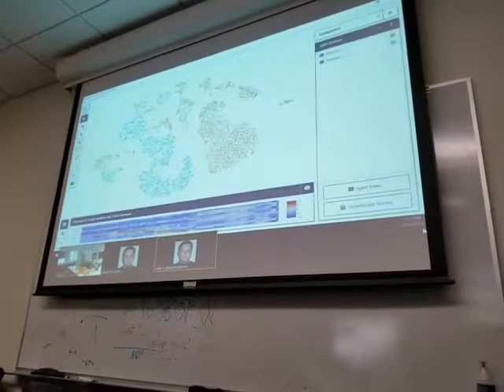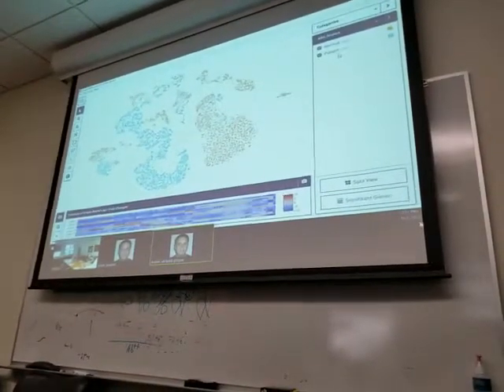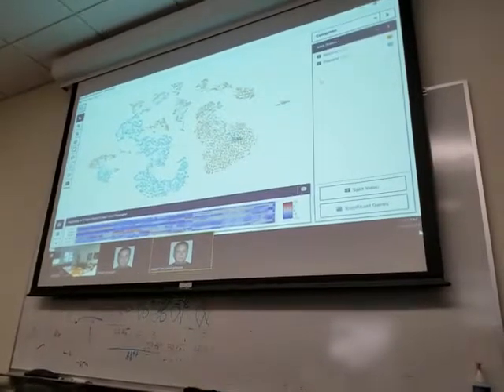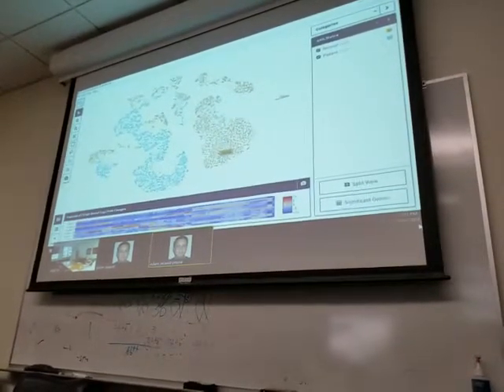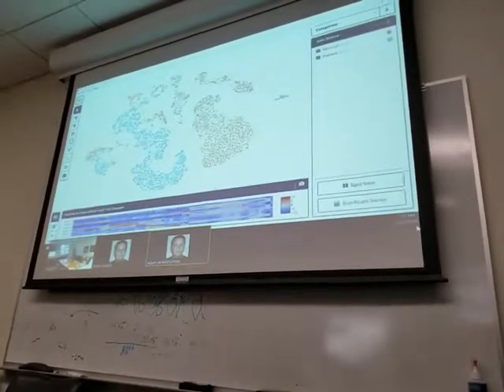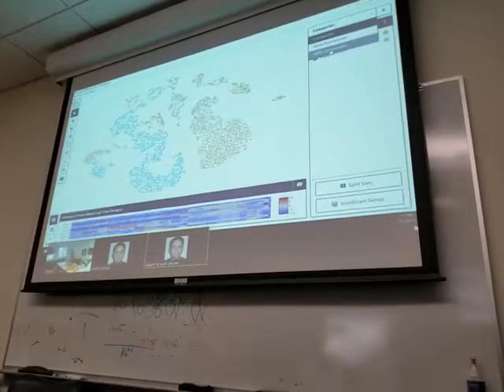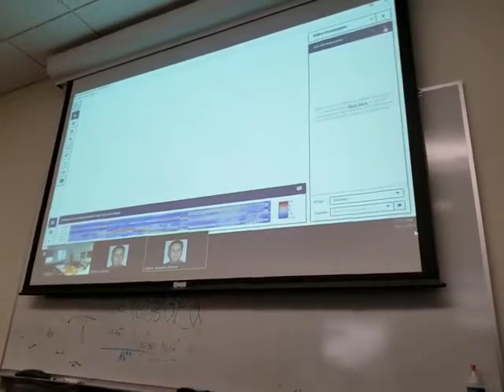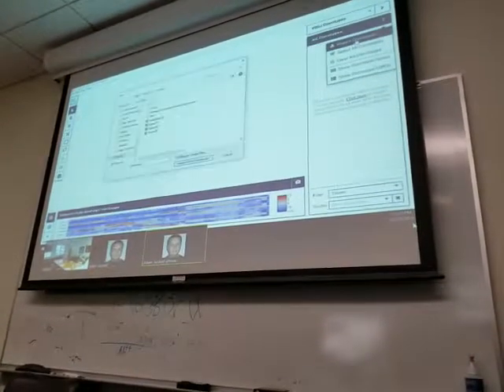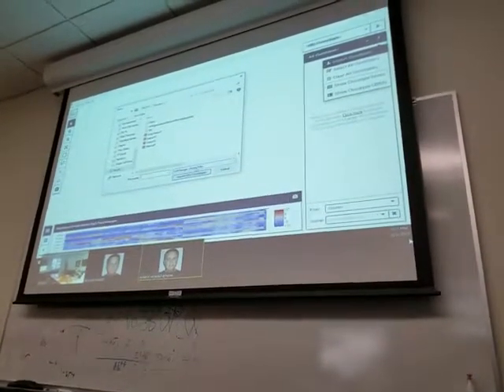So, in the case of gene expression, what we are importing is VDJ clonotypes and seeing what clonotypes are present. So we can just simply open the VDJ file by this Loupe browser. Yeah, you go to VDJ here, and then import, and then you have to see if it wants to find a VDJ loupe file.